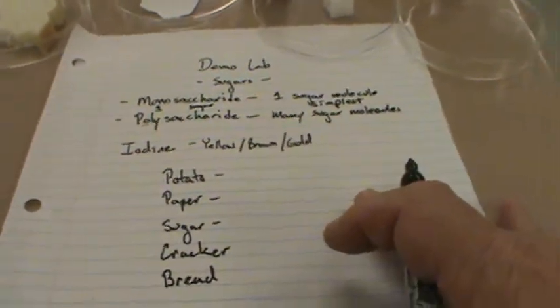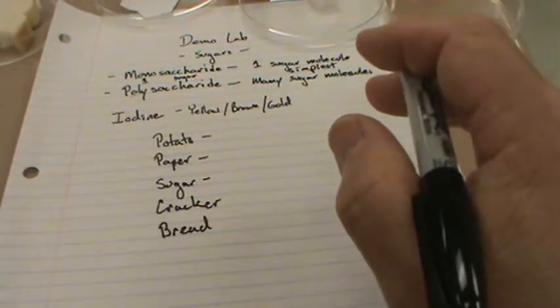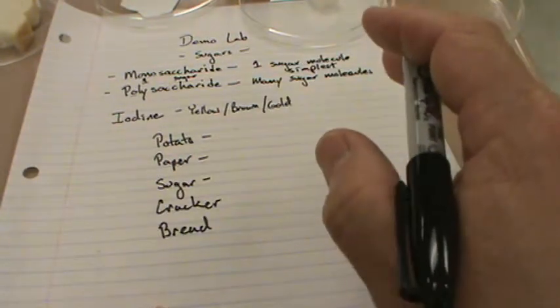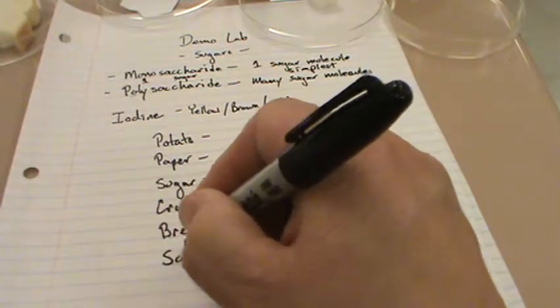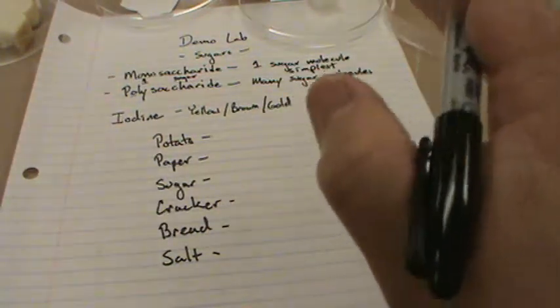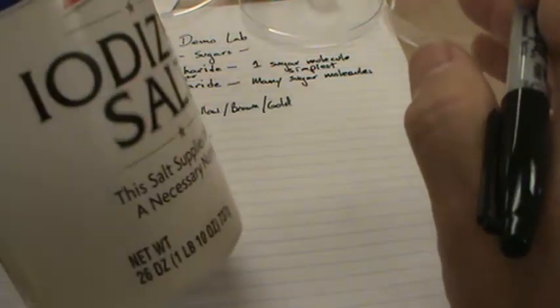And lastly, I've got a control for this because what we're going to check is to see if the iodine, once it hits either the polysaccharide or the monosaccharide, supposedly should change color. But I've got a control here. I also have salt. I want to know, will the iodine change colors if it hits something else that's a food that we eat? So I have some salt. There's the salt right there.